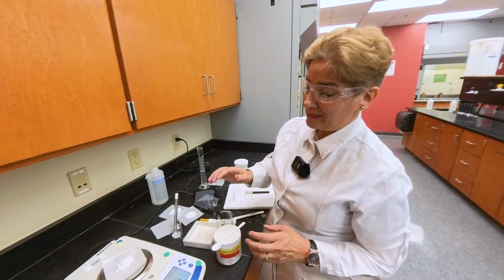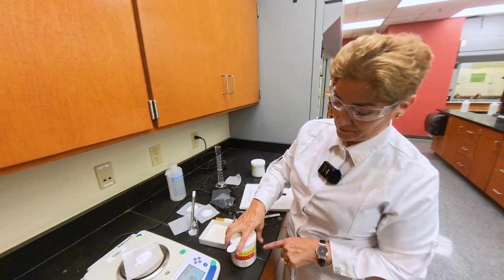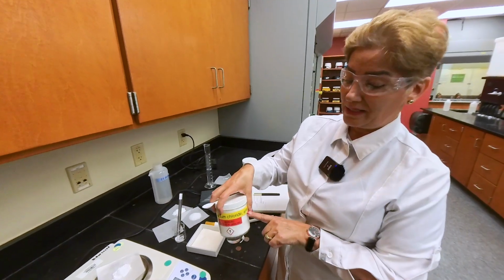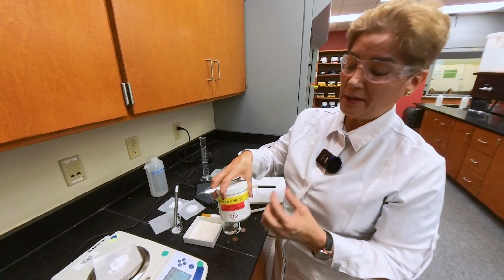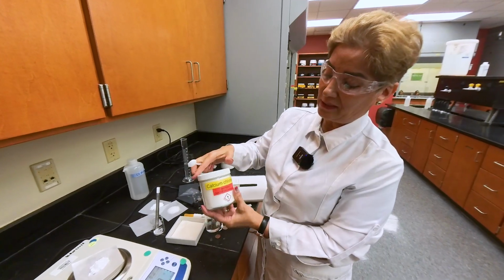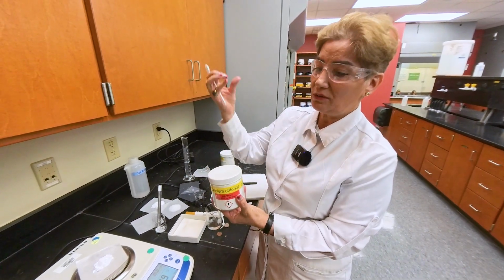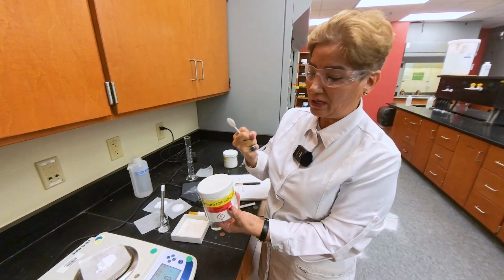It's a good practice, and the purpose of this experiment is for you to know that if something says anhydrous, it has a potential to absorb water from the air. So as soon as you use this sample, you must close the cap. If not, it's going to absorb water. It becomes like a rock.